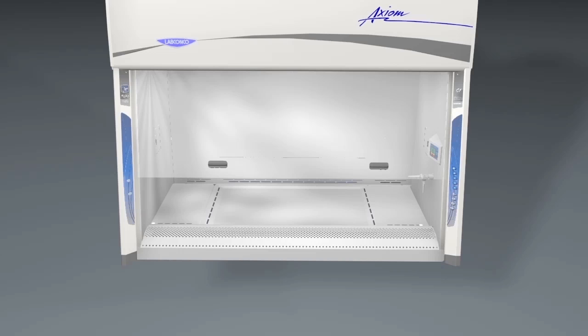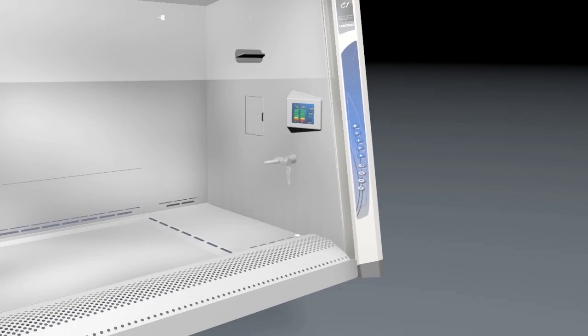Using the Axiom's MyLogic operating system and LCD display, the BSC can be programmed to adapt to the needs of any user and can be controlled by simply lifting or closing the sash.